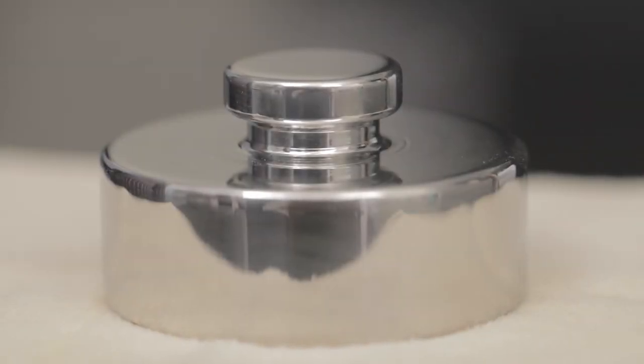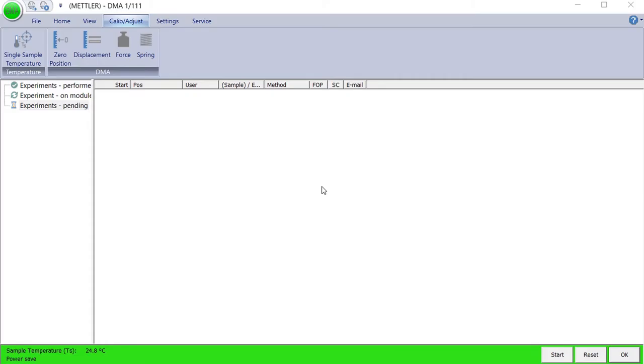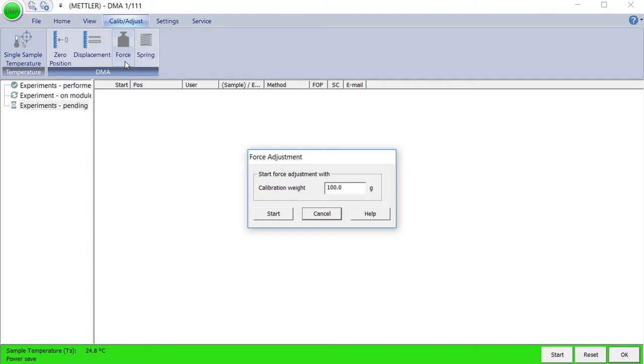And a reference weight of 100 grams. In the module window of the STAR-E software, start the adjustment by clicking Force Adjustment on the Calibration Adjust menu. Enter the correct reference weight of 100 grams and then click Start.